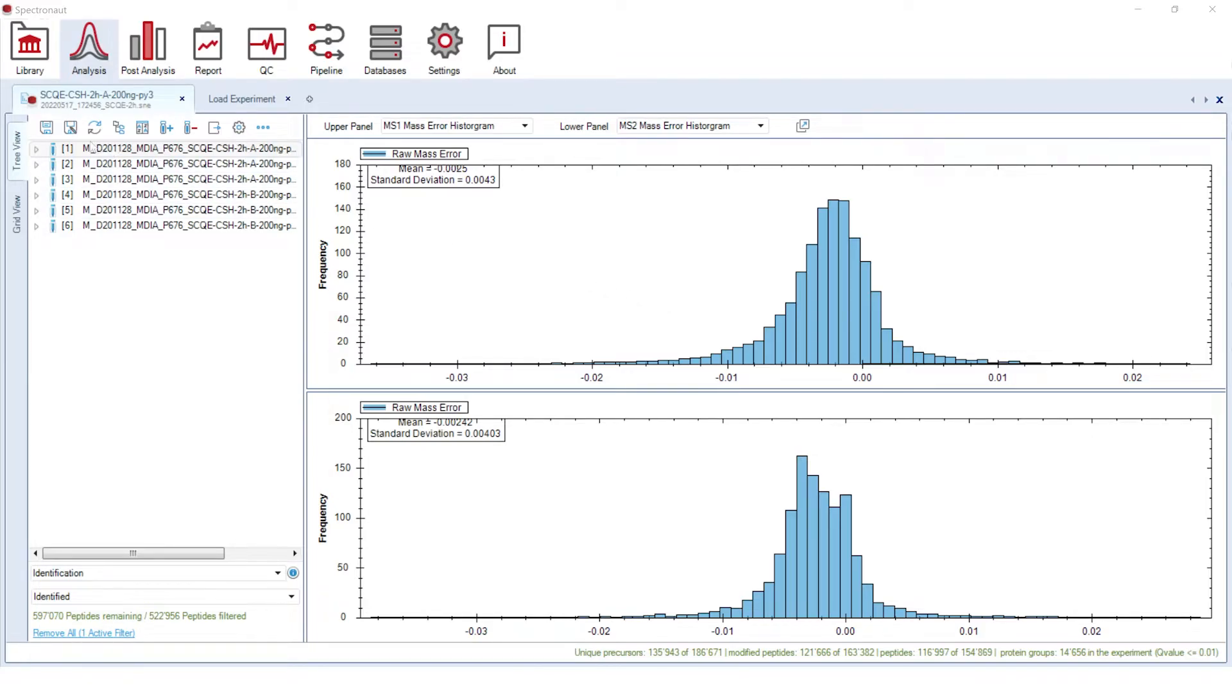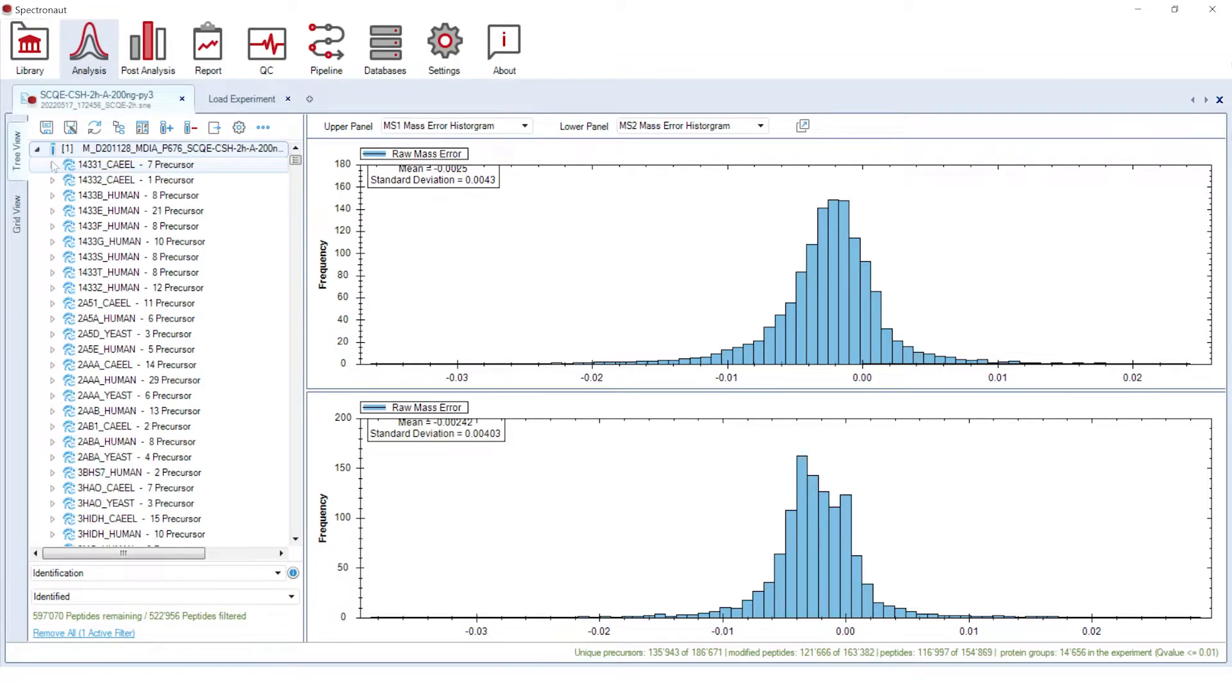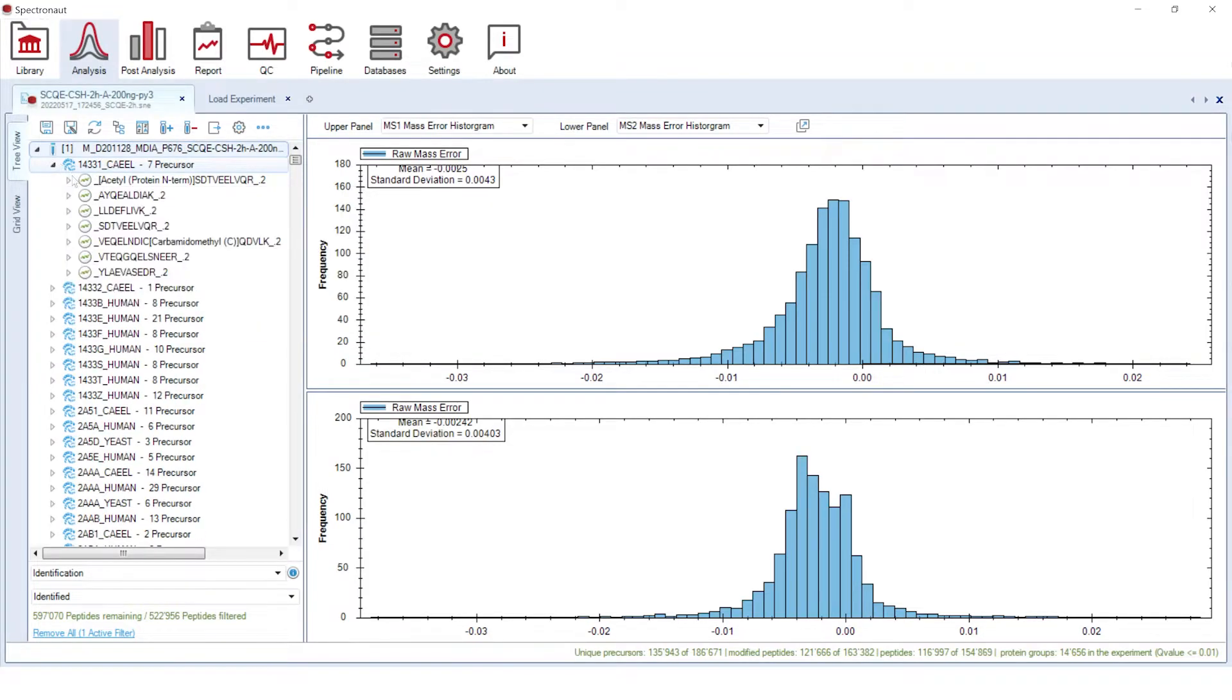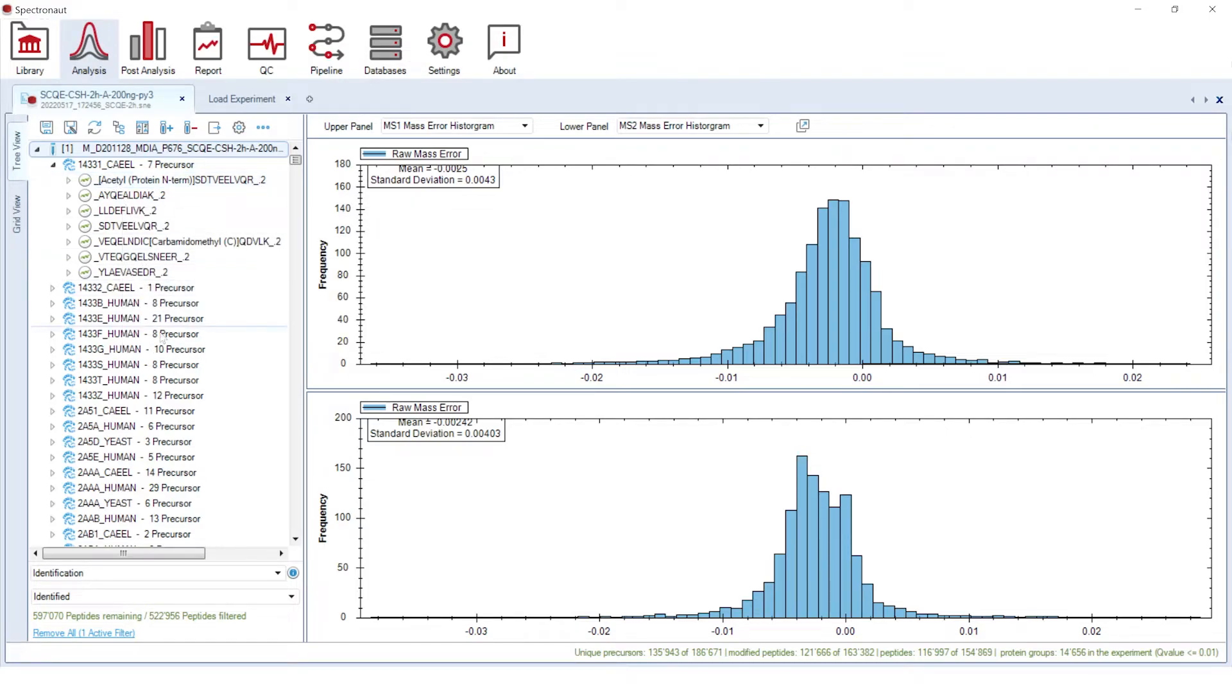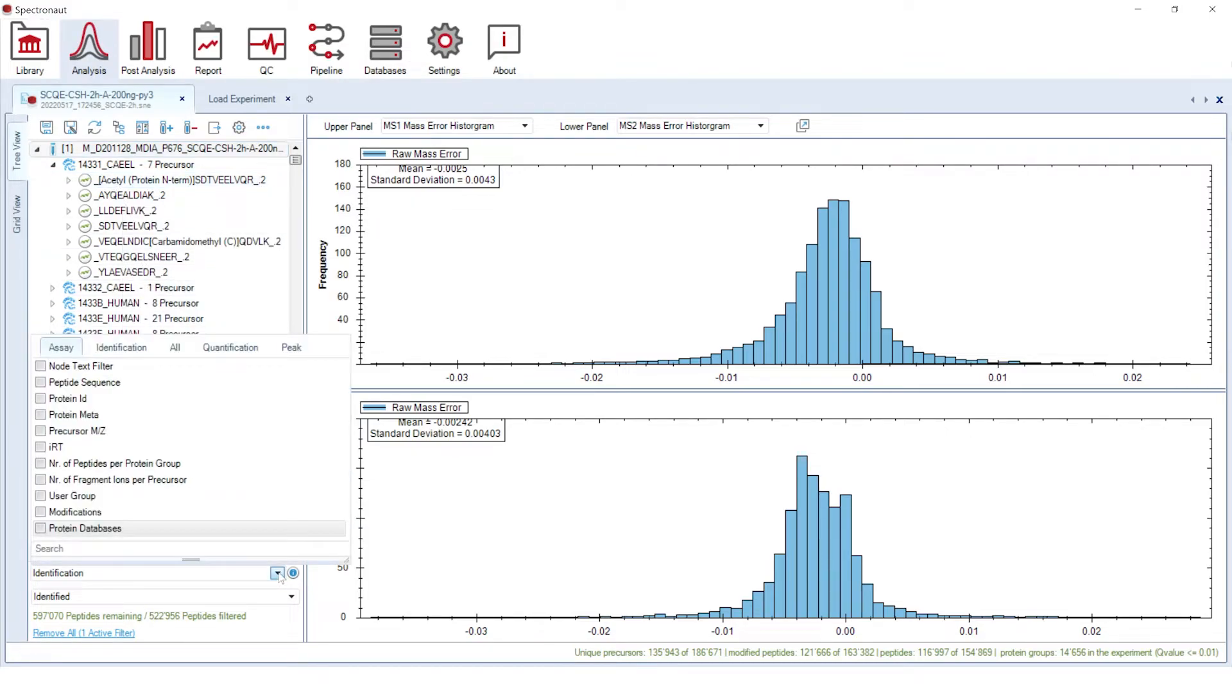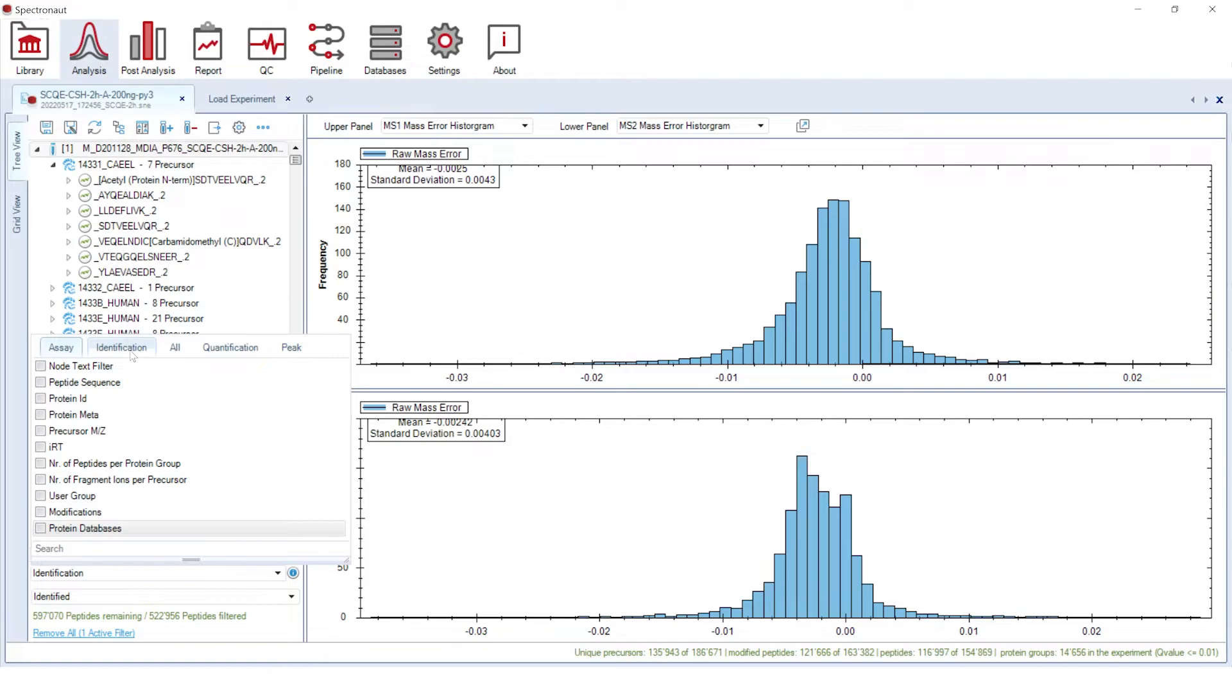The tree view will allow you to go further into the details of the identification and quantification of each precursor. In order to navigate through thousands of precursors, you can use a number of practical filters related to peak features, quantification, identification and assay. Among those, you can find the newly added filters for modifications and protein databases.